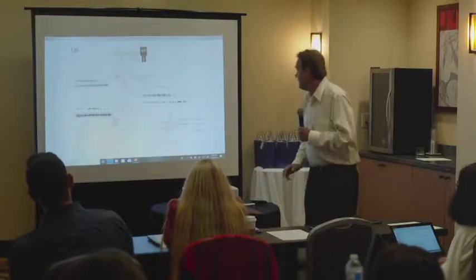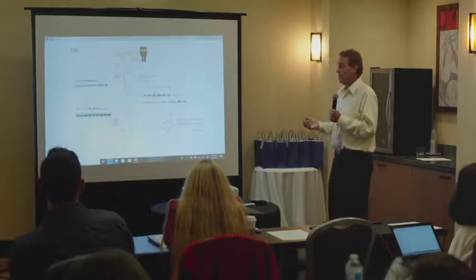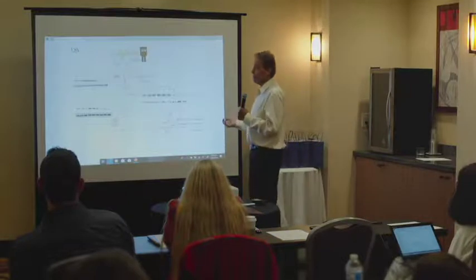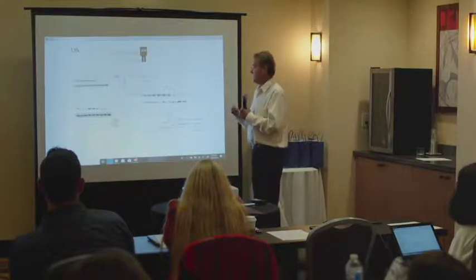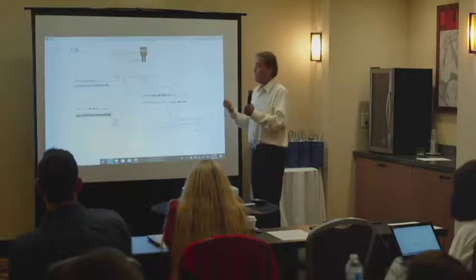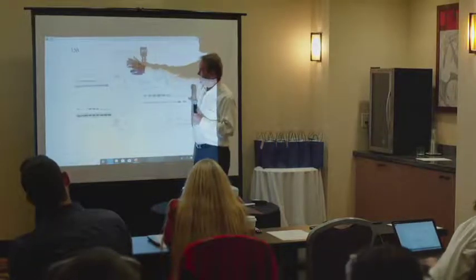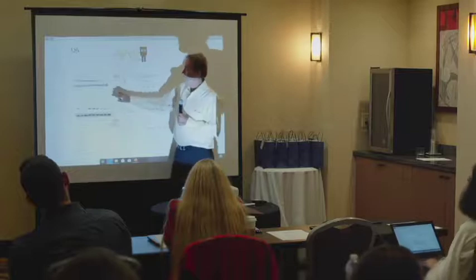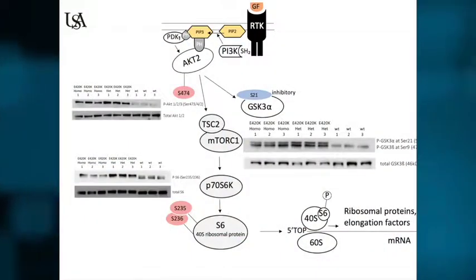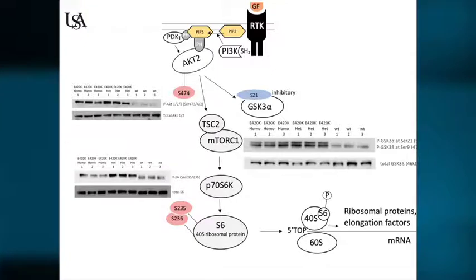So the addition, and this is something that Chinta has done, so she's taken the homozygous cells, so these are the cells that have the variants in both alleles, and we're predicting that this is a dominant mutation, because that's what you see in the children where you have one allele mutated, and then you see the effect. And that looks like that's true. So far we're going back to validate the pathway with the homozygous cell line. So here's 3 replicates with the homozygous, 3 with the heterozygous, and the wild type. And again, this AKT-mTOR pathway that Rita talked about is being validated.